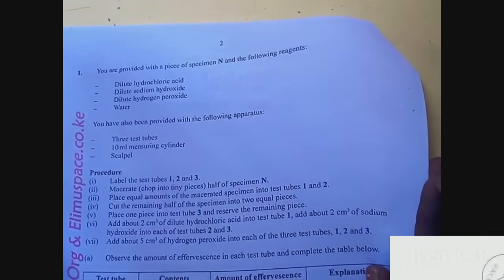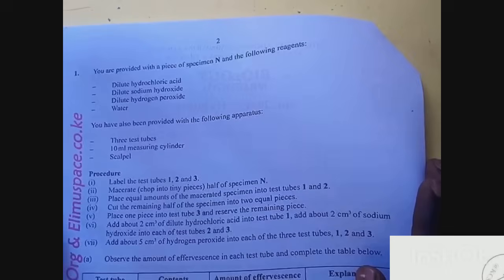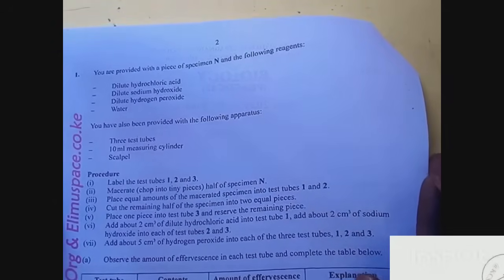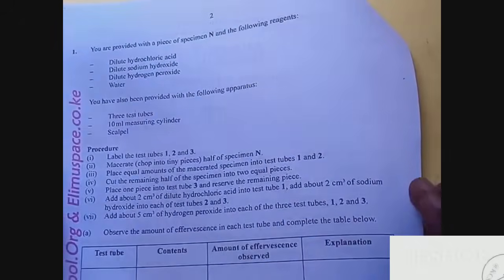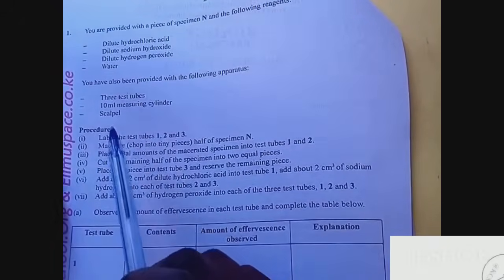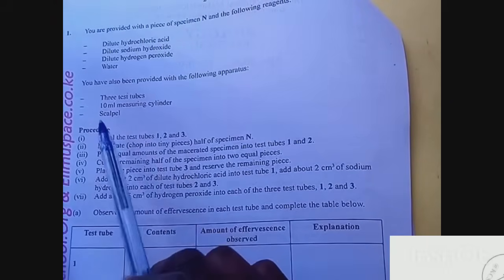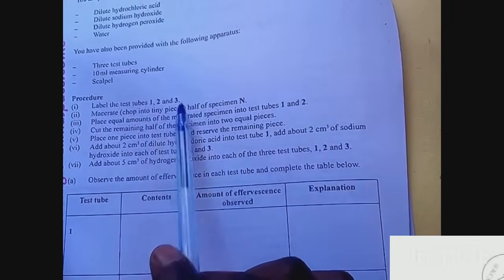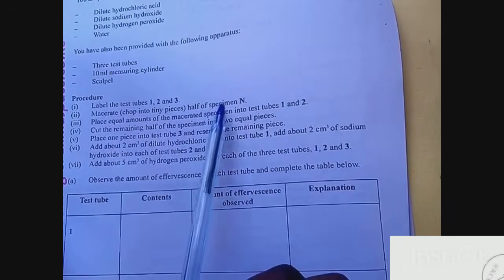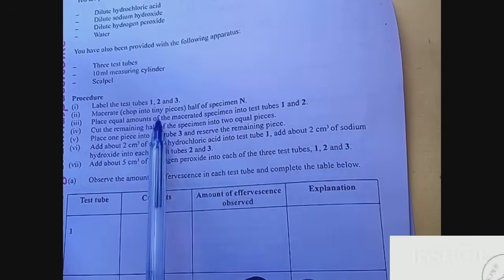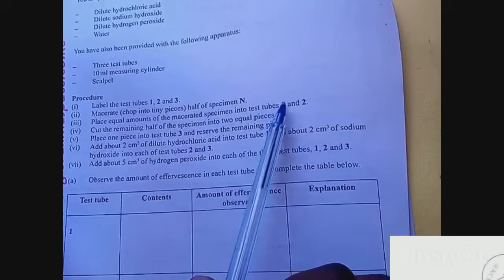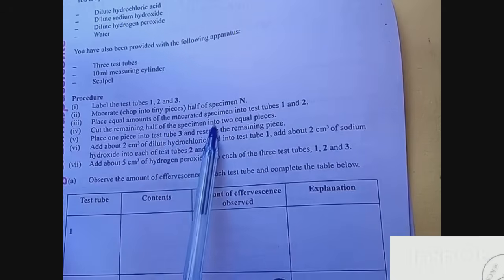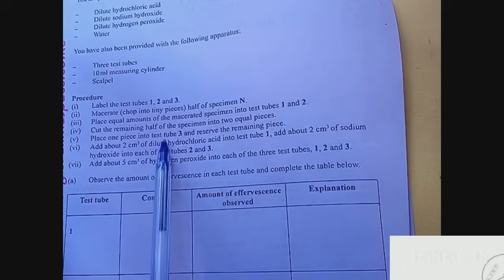As you can see, question one says you are provided with a piece of specimen N and the following reagents. Specimen N was a potato. You have been provided with three test tubes, 10 milliliter measuring cylinder, and a scalpel. Let's see the procedure: label the test tubes one, two, three. Macerate or chop into tiny pieces half of specimen N. Place equal amounts of macerated specimen into test tubes one and two.